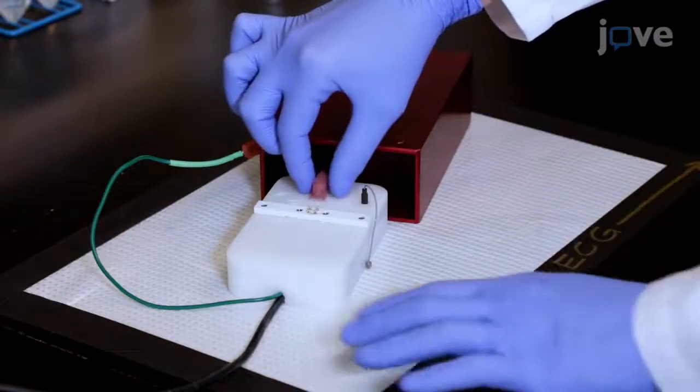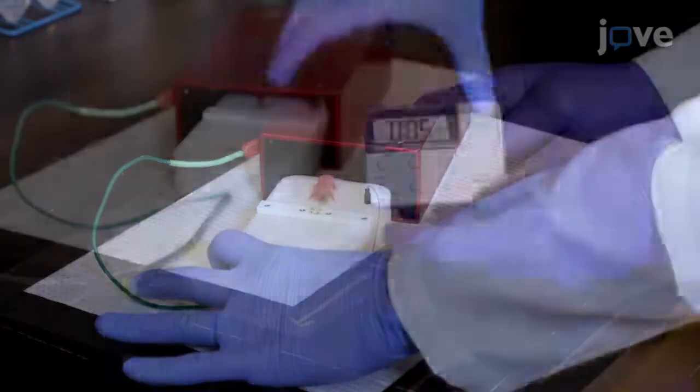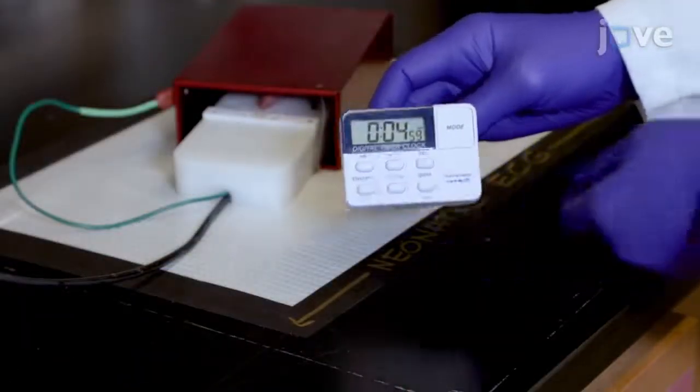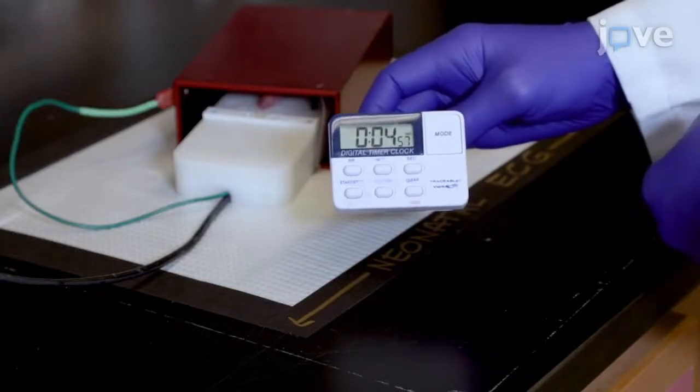Place the pup on the heated surface of the platform and allow the animal to acclimate to the surface for approximately 2 to 5 minutes in the dark.